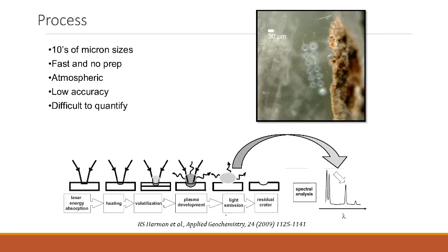Here's how the technique works. The laser is applied and the surface gets very hot. It starts to volatilize and make a small cloud above the sample. This emits light as a plasma as the electrons come crashing back down to the ground state. That light emission is then sent to a spectrometer, and you're left with a tiny crater, like those seen in the gypsum crystals above. This is not terribly destructive. The holes are 70 microns across, but nonetheless it is a destructive process.